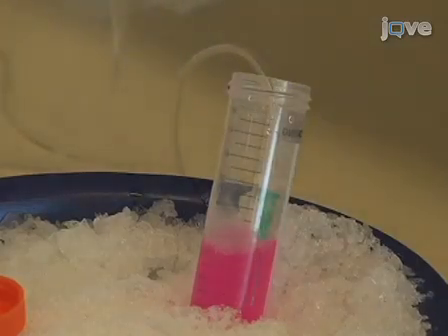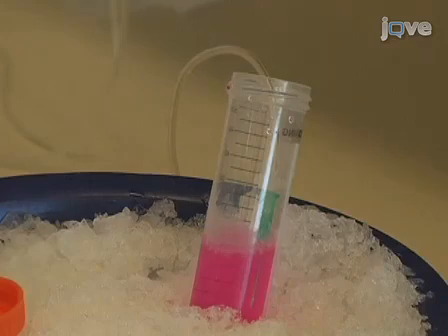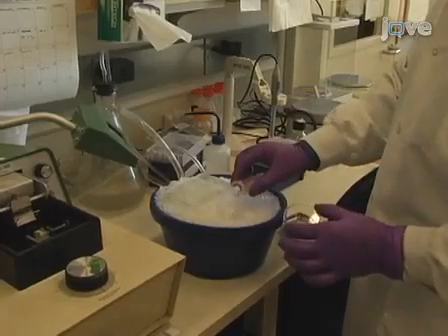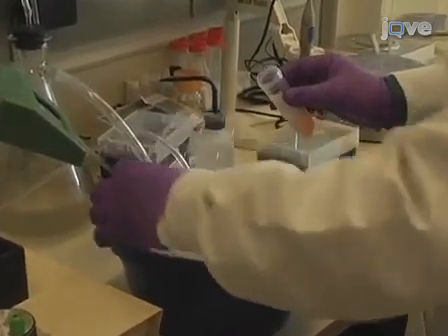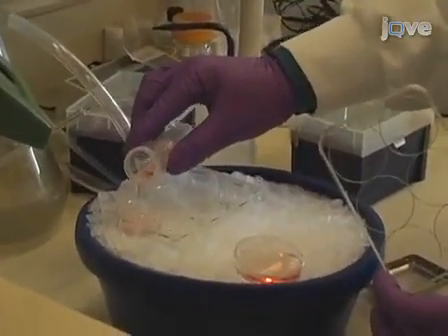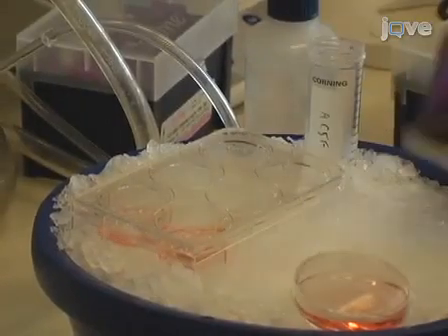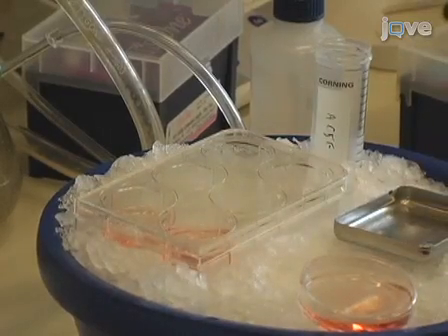Next, bubble the ice-cold ACSF media with carbogen gas. Saturation of the media with carbogen alters the pH of the solution and produces a color change from red to orange. Pour a little of the ice-cold bubbled ACSF media into a sterile petri dish and a 6-well plate. Place these on ice together with the plate of the vibratome that will be used for slicing the brain. The petri dish containing bubbled ice-cold ACSF media will be used for dissecting the brain from a P8 to P12 mouse pup.